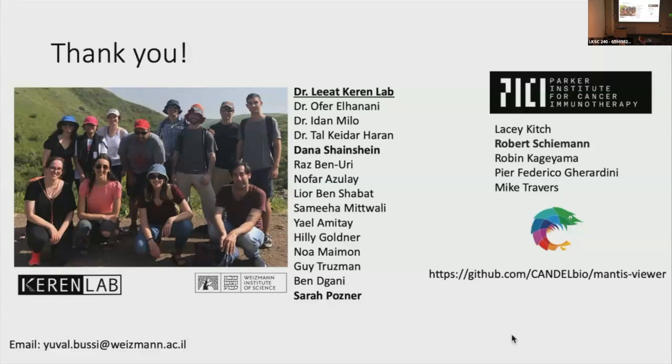And then how many corrections do you need to do for the human in the loop usually till you feel like it's dialed in as well as you want? Yeah, so we usually do around 3,000 to 5,000 corrections. Takes about 2 weeks. Yeah, that's not bad at all. That's awesome.